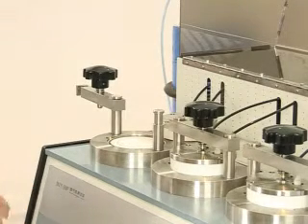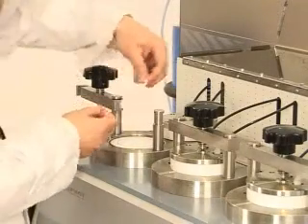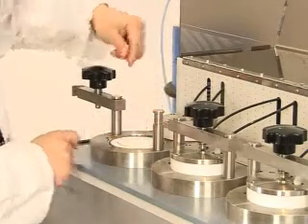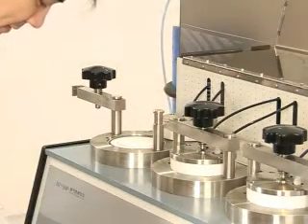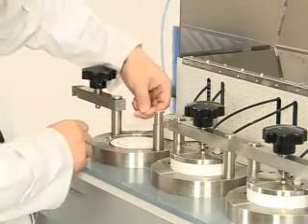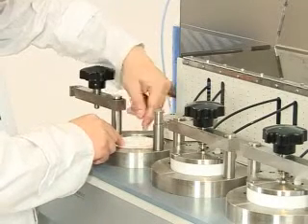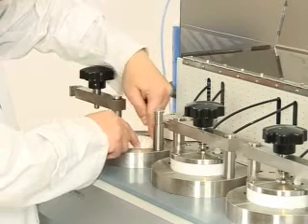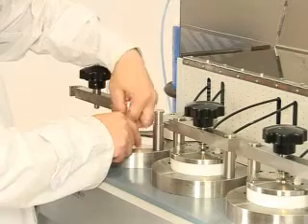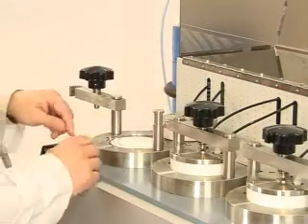After this, put the filter paper into the first circle, and then mount the sample. You must be sure there is no fault on the sample.